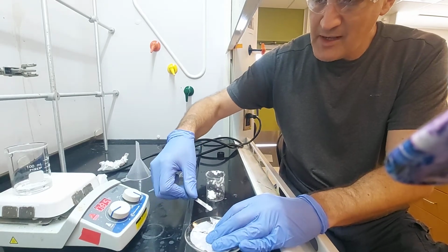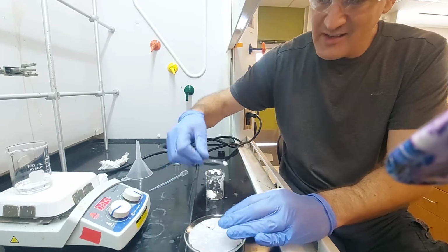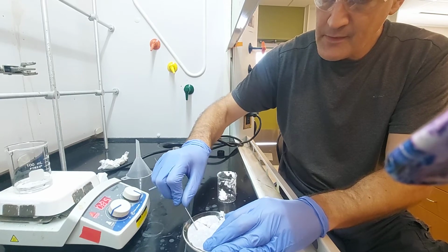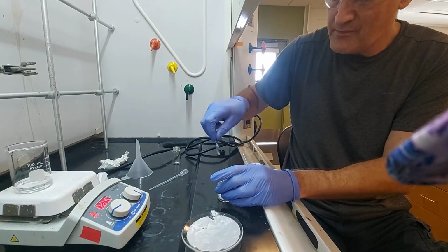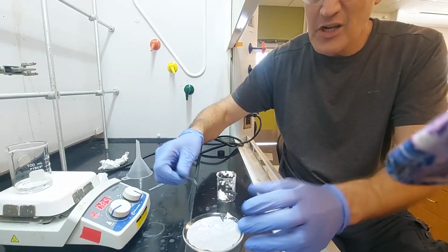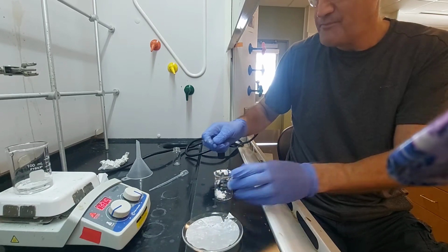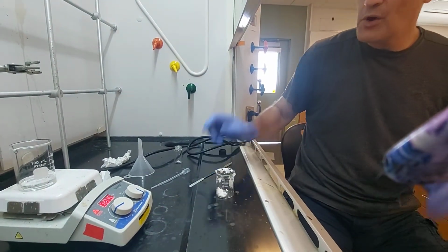Now there is still a bunch. I'm trying to get it all, but actually there is no way for me to get it all. But I'm going to get what I can. And then, all right. So this is not going to be perfect, but I have what I have. If you get paper in there, you can usually find a way to scoop it out. Yep, right. Okay, so here's our product.